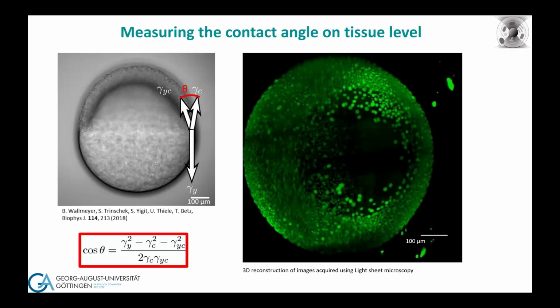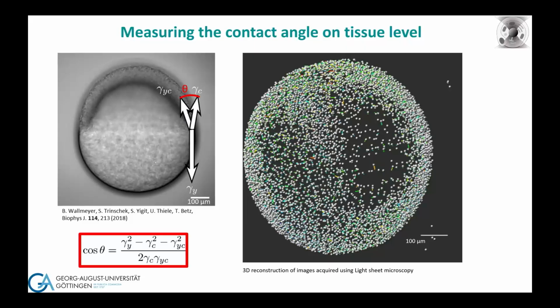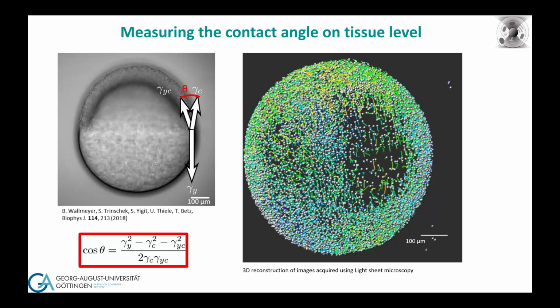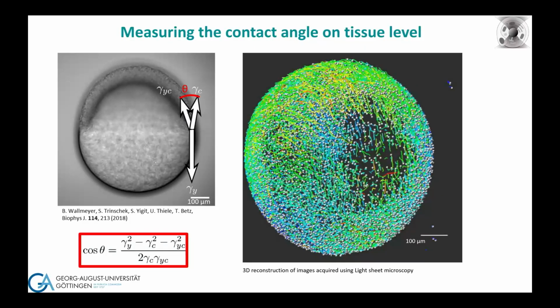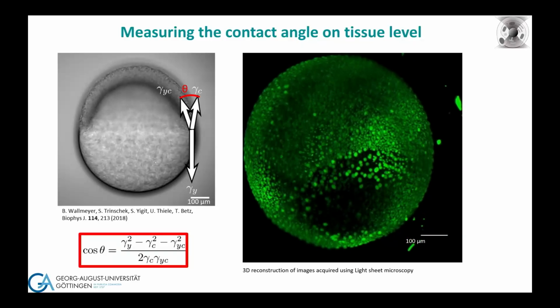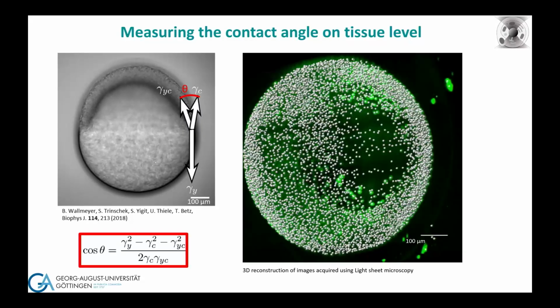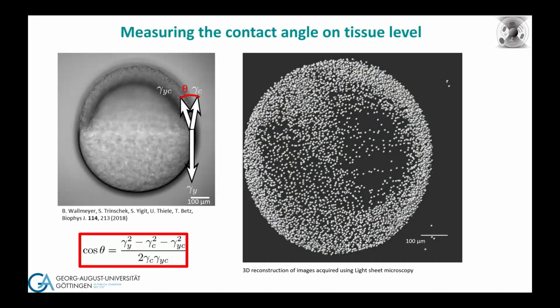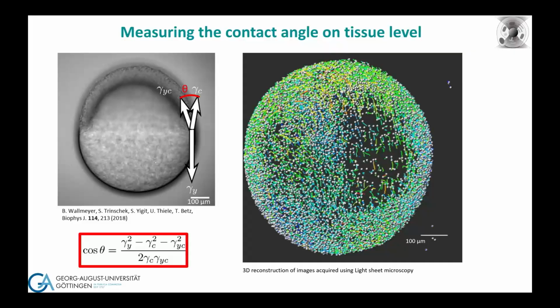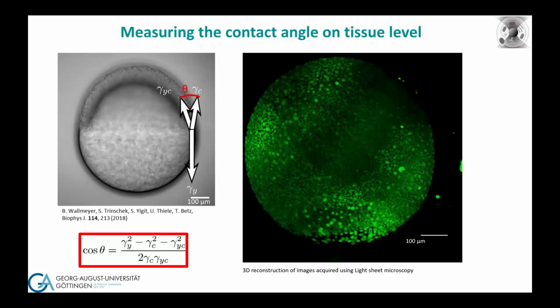This is now quite late in this process. So typically we just use this early moment here. You can do the tracking of the cells. We have seen all of this beautiful data yesterday by Merlin. So it feels kind of lame to show this here, but we can also do something. But actually I will start to try to copy what they have. The important part here, though, is that all the physics that we care about from a wetting perspective is hidden a little bit in this contact angle.